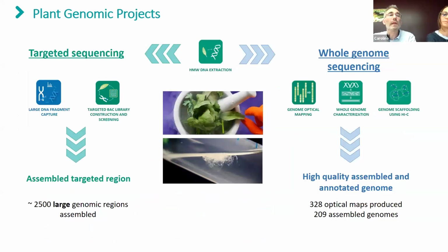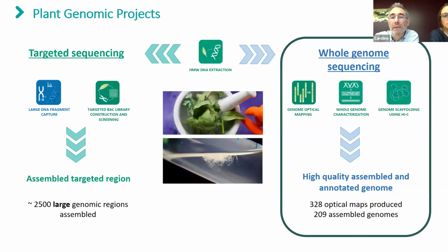So during all this time, we have worked on different projects and mainly focused on two types: the targeted sequencing, or the whole genome sequencing. And I will start to discuss this aspect.